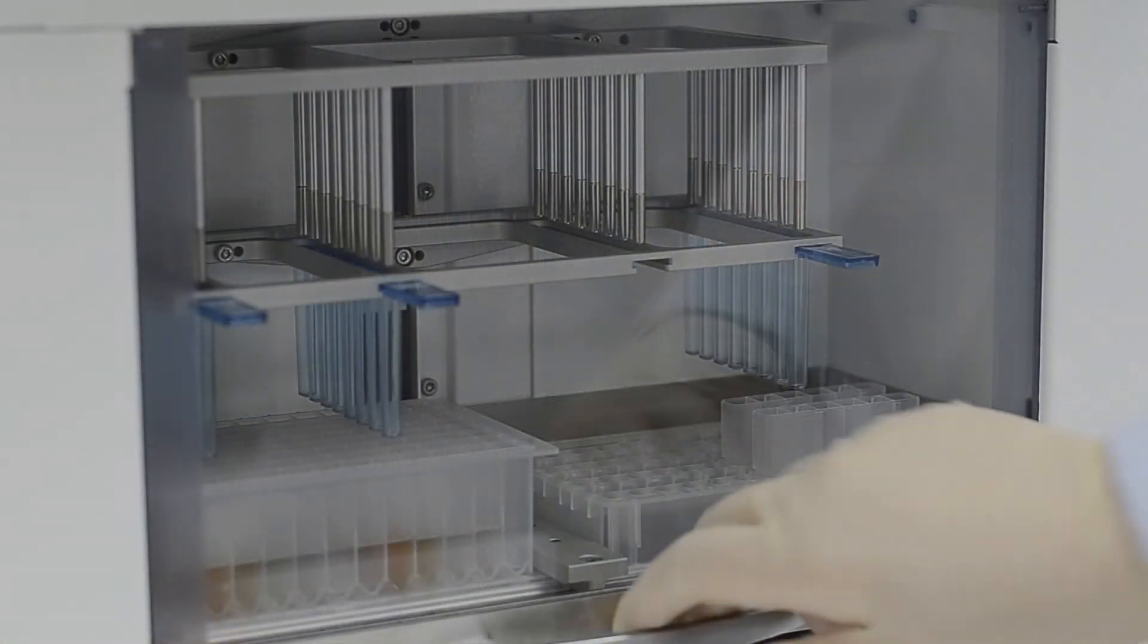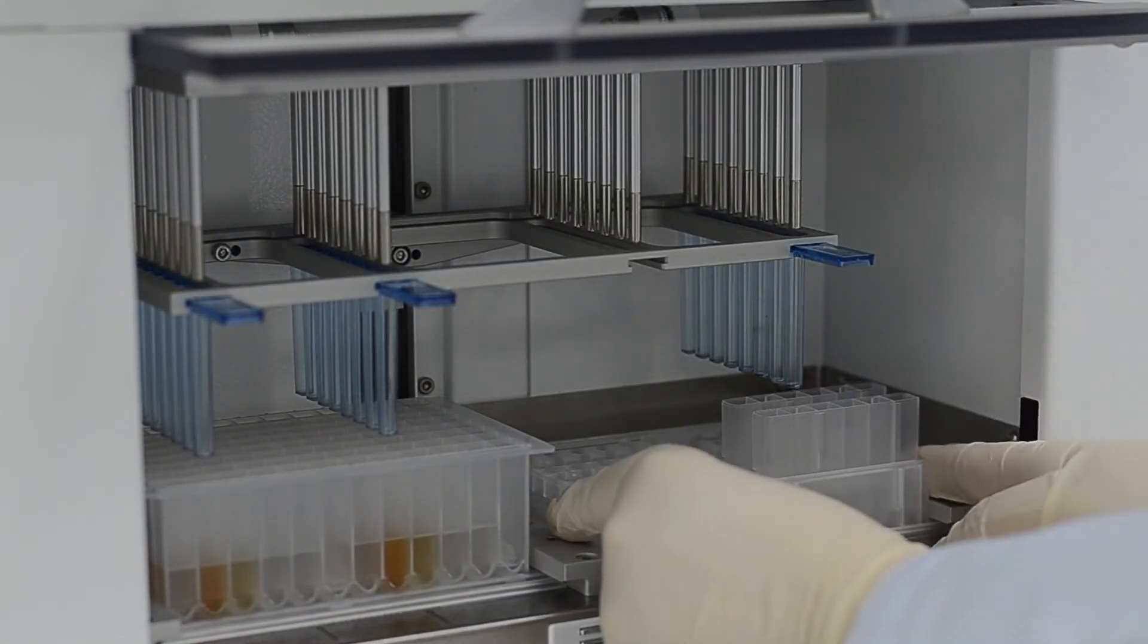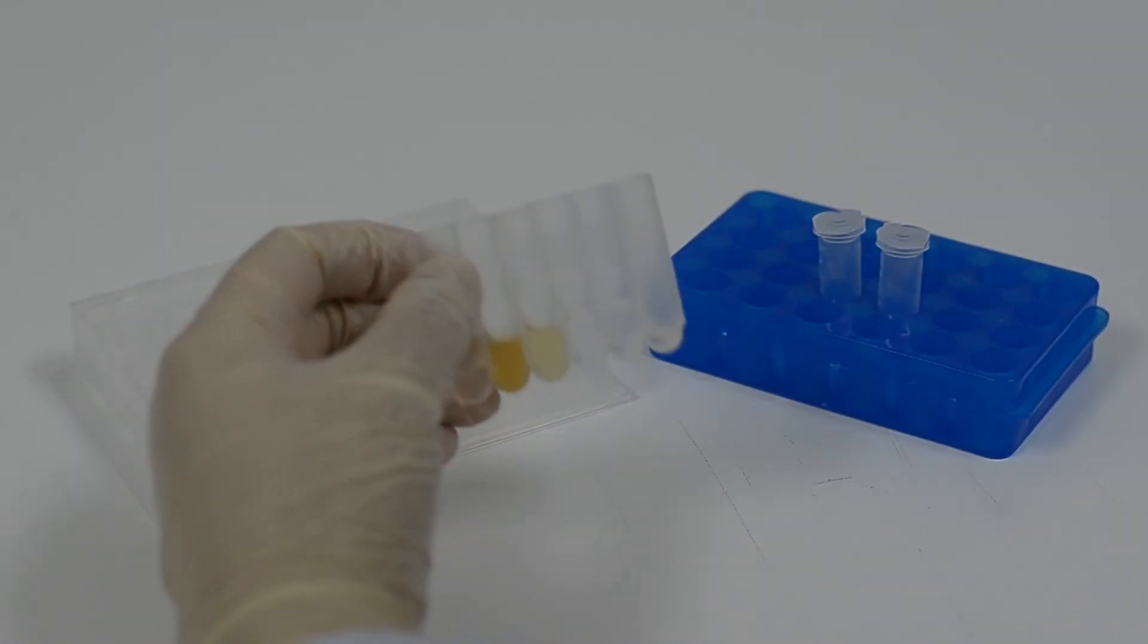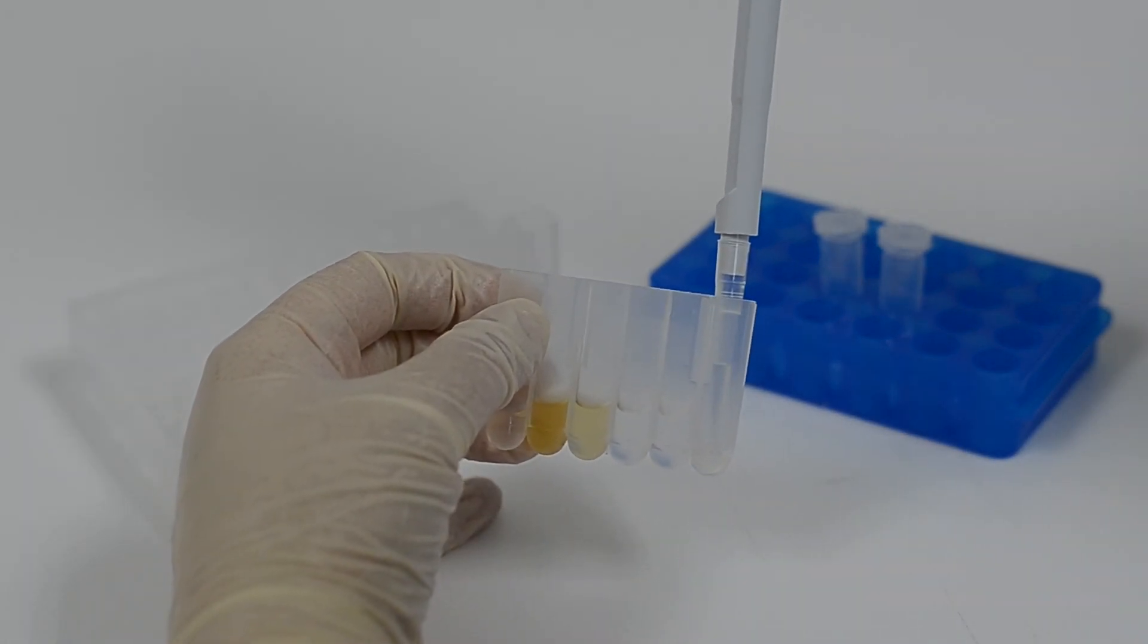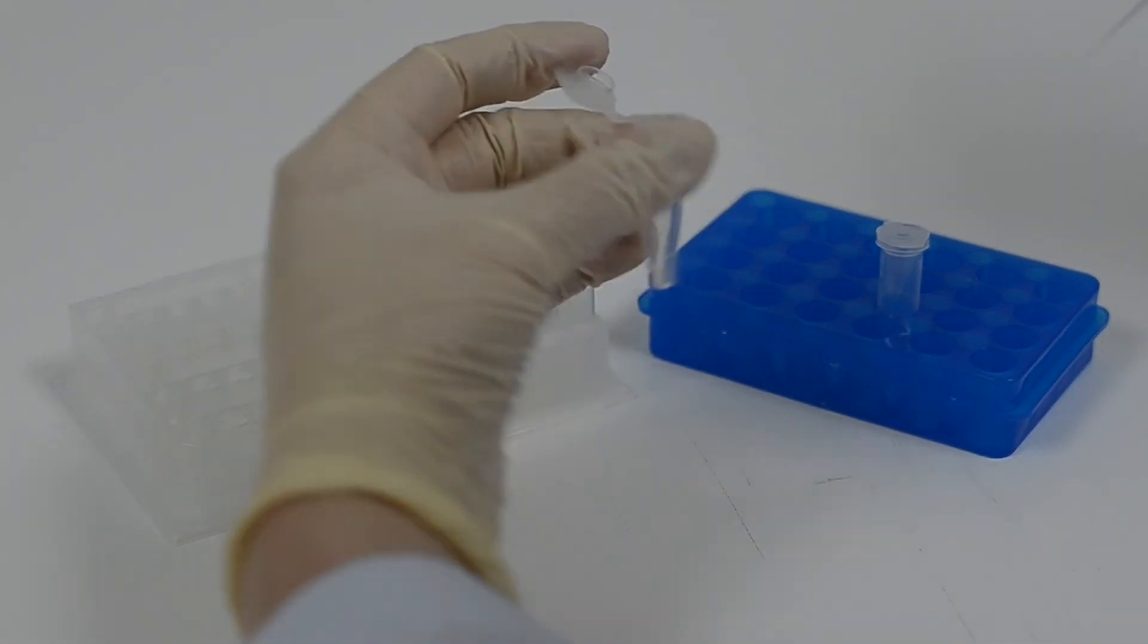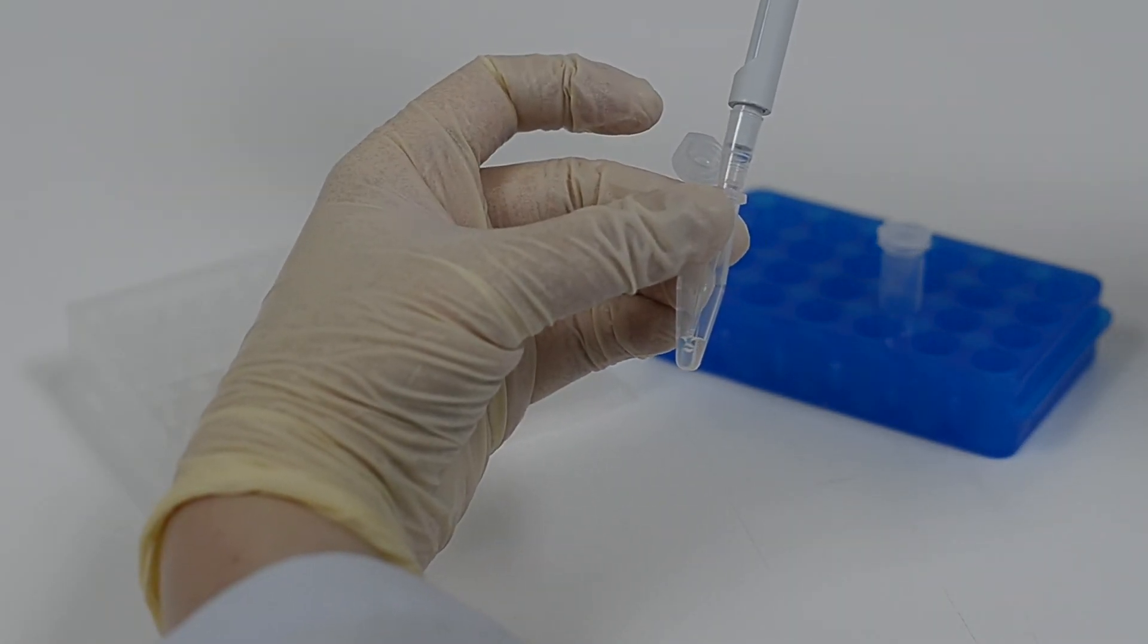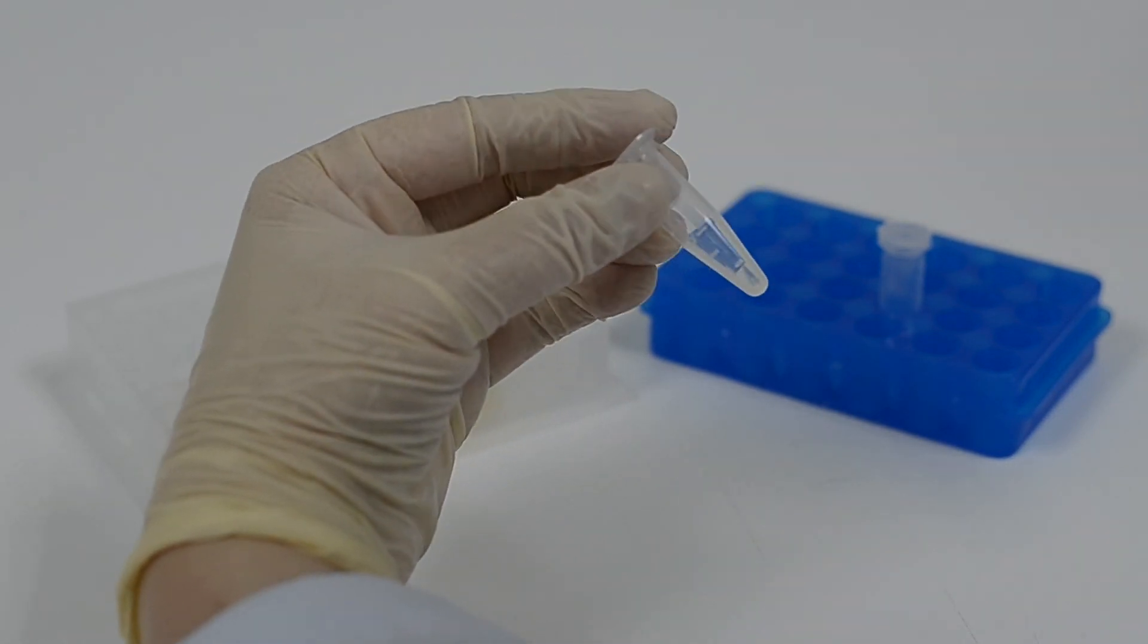After the program ends, remove the reagent plate and tube. Transfer eluted DNA from 6 and 12 well to a clean 1.5ml microcentrifuge tube. DNA is now ready for PCR and other downstream applications.